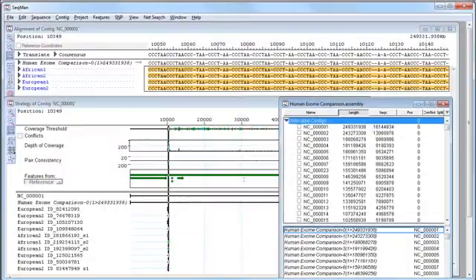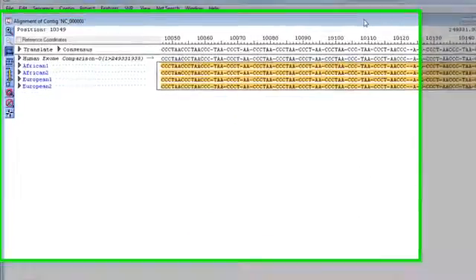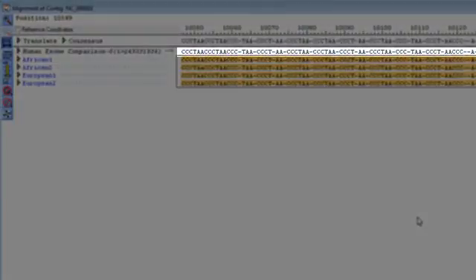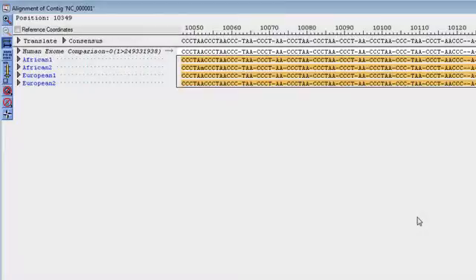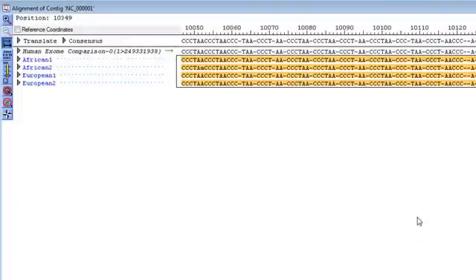Once your multi-sample data has been assembled, you can begin your analysis in SeekMan Pro. You'll see that in the alignment view for multiplexed data, my reference sequence is shown here at the top, and then I can also see the consensus sequence for each of my four samples.